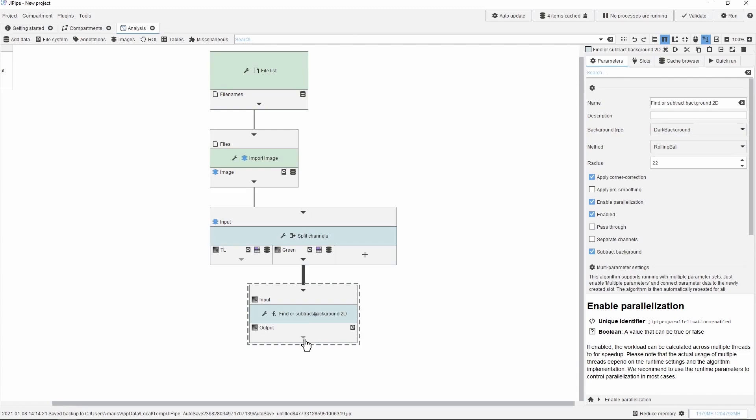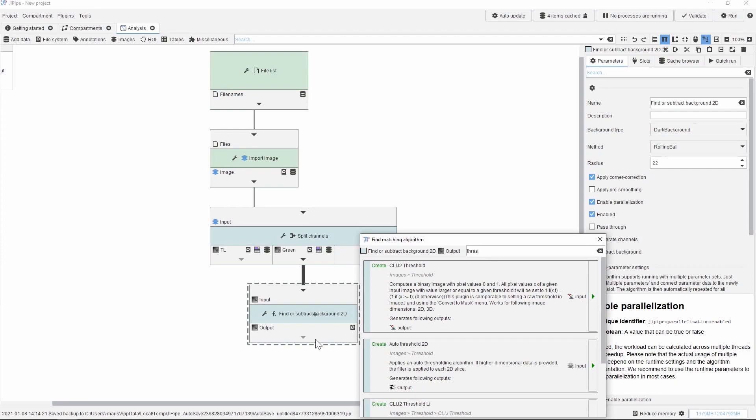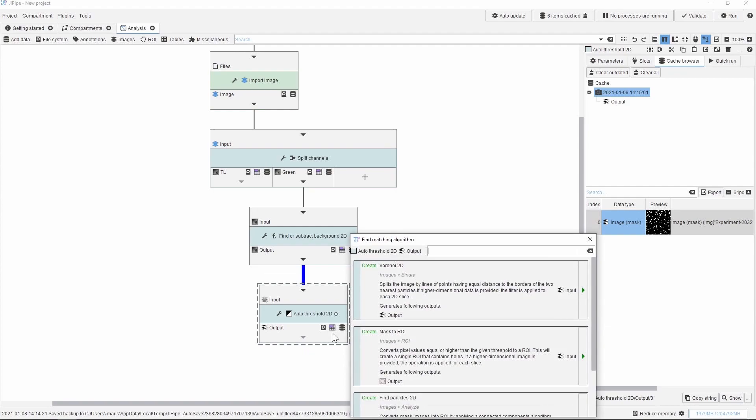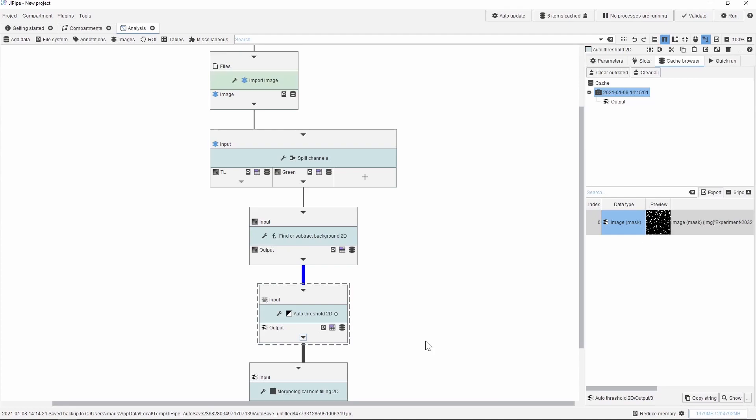As we did in ImageJ, we now look for an auto-thresholding method using a node called auto-threshold. Once we added the new node to the graph, we look on the right side again and set up the parameters, setting it to the triangle method. The next step is the hole filling of the binary image. We can find this by searching for the words hole filling, and this way we will get another new node in the graph.